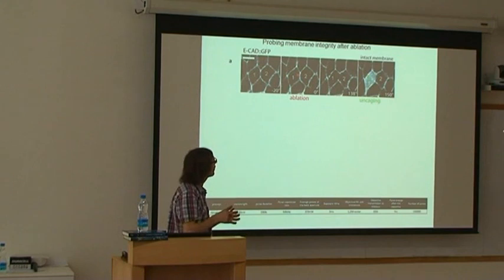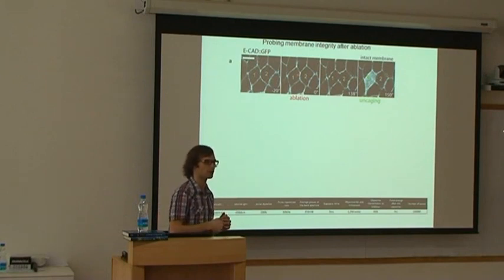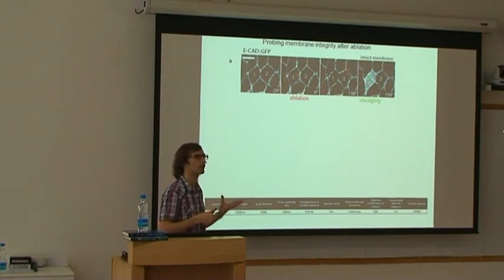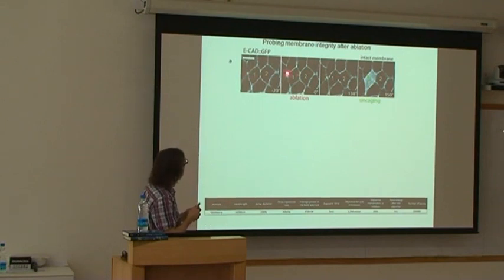And what happens is that this molecule is present within all the cells, because by injecting it at an early stage, while the cells form, each cell will have a reservoir of this molecule. And this molecule is not visible until you uncage it, normally with a UV laser. This is the kind of laser or wavelength that this molecule needs to be uncaged and to be visible. So this is what I do. I do the dissection, and after that, I uncage the molecules to see if there are leakages.